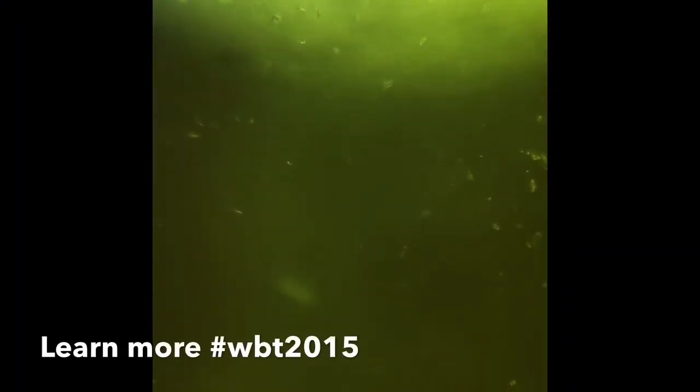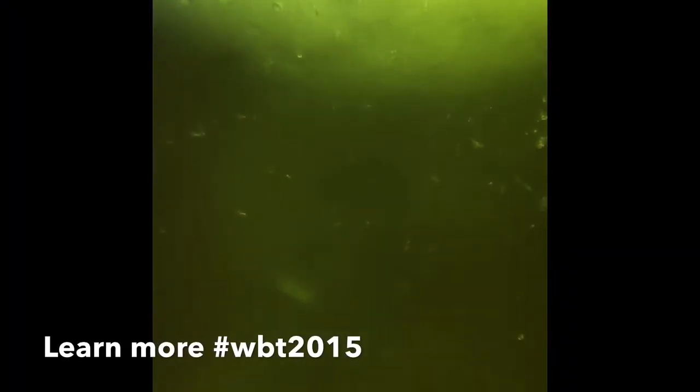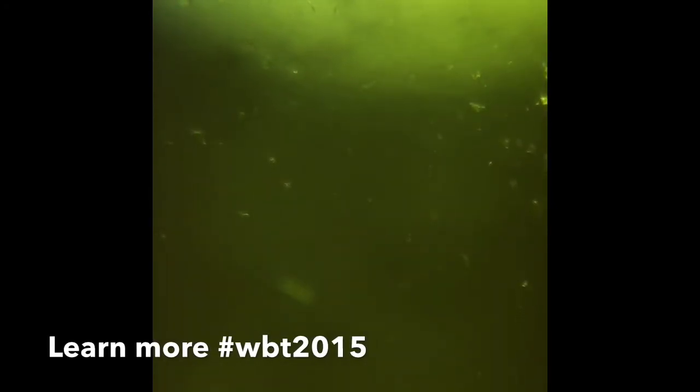Okay, let's see what happens. So what we're looking at here is my cheek cells that I scraped off, right? Mm-hmm. So these are floating around even though they're wedged between two little... Right, so they're between a glass slide and a glass cover slip. Right, and they're sort of suspended in the liquid in between. Wow.